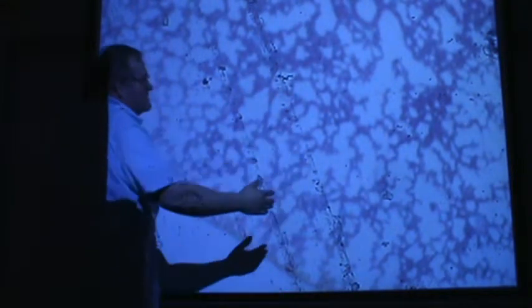Please don't think that's what you're looking at. As you're bringing the slide into focus, these are actually defects. This up here in the top. These are actually defects in the tape over the sample.